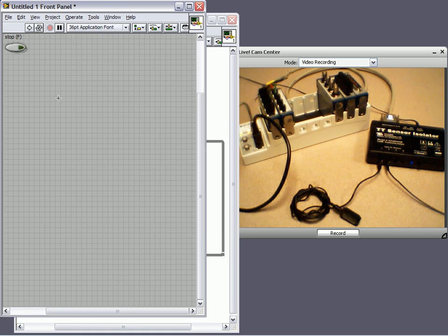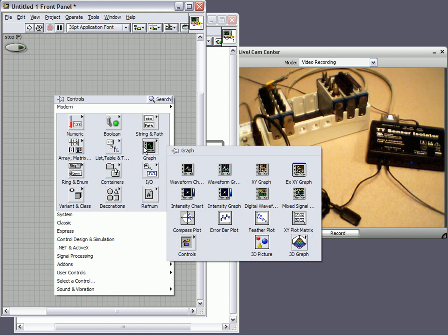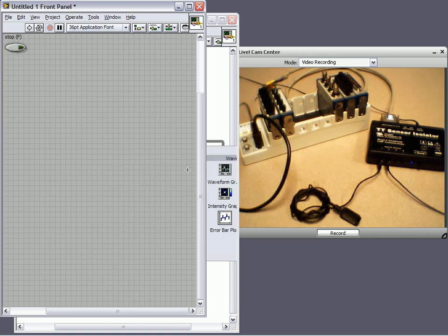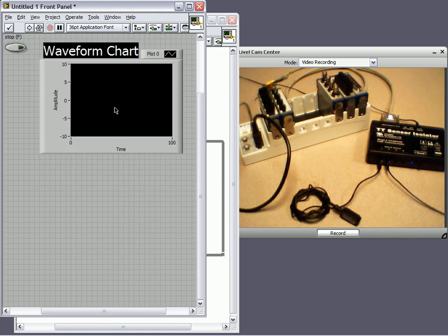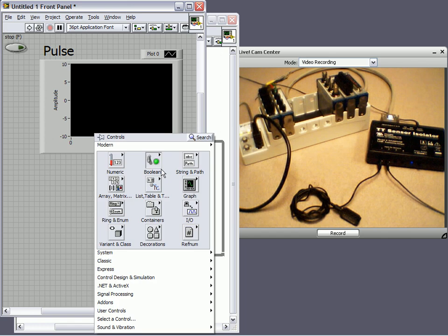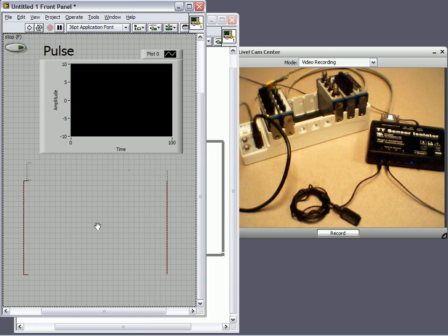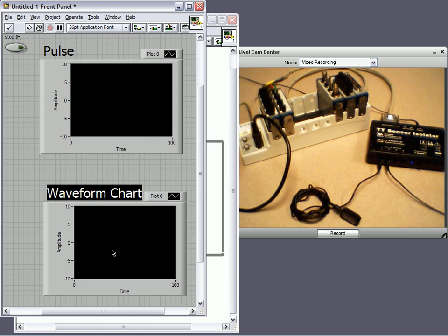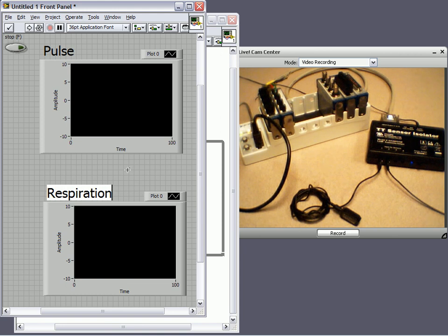Let's create those charts. If I go to the front panel, I can go to the control palette, to the graph sub-palette, and place down a waveform chart. Let's call this pulse. Now, I can place down a second waveform chart. In this case, I'm going to call it respiration.